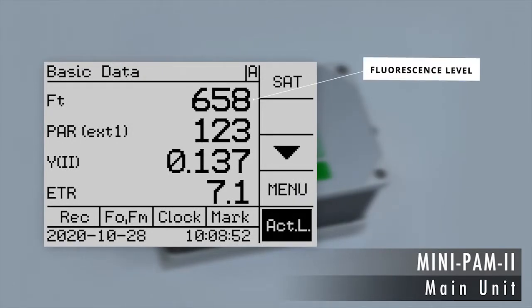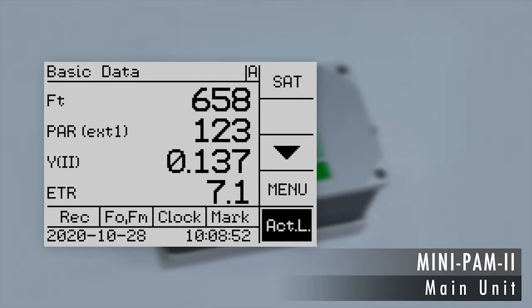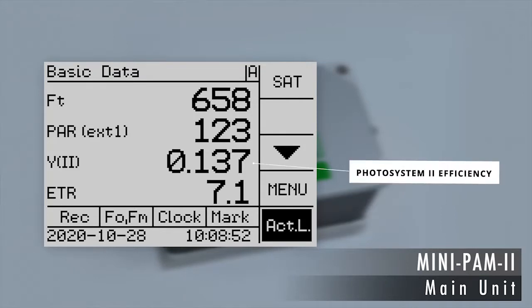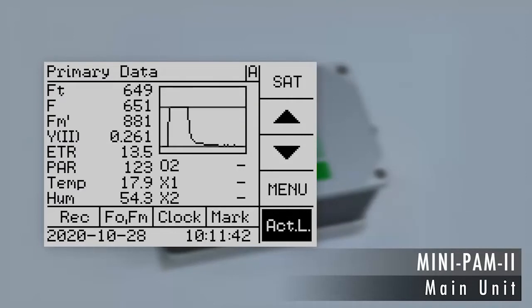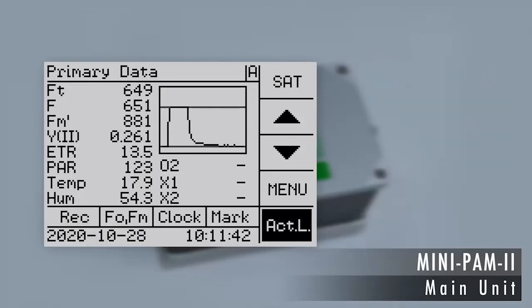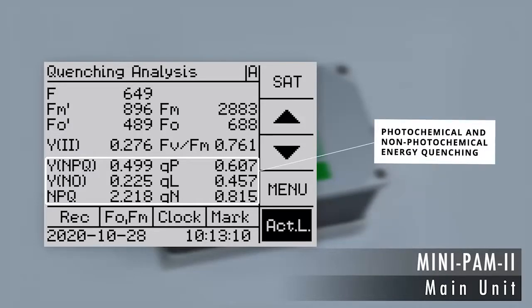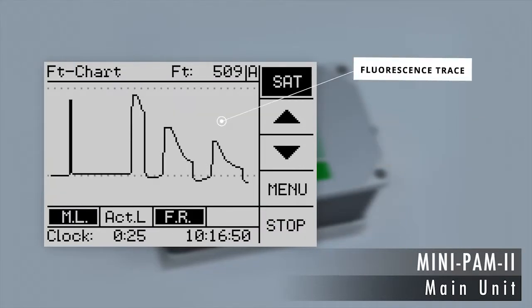The key parameters include the fluorescence level, the photosynthetically active radiation (abbreviated PAR), the efficiency of Photosystem II, and the electron transport rate. More data plus the fluorescence kinetics of the last saturation pulse can be found on another screen. The parameters of photochemical and non-photochemical energy quenching are only a tap away, and you can also view the time course of fluorescence.